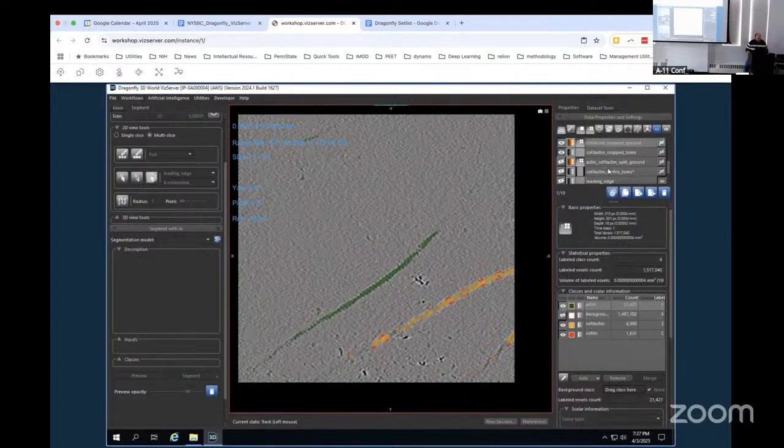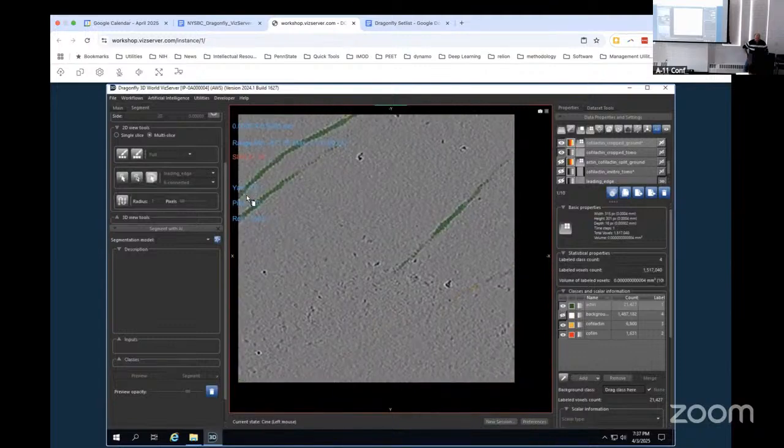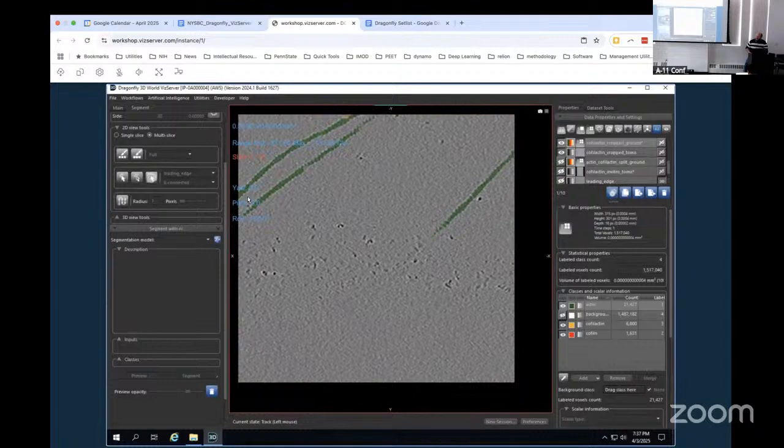It's called cofilactin cropped ground. This is the one that has already been cleaned up. So I've already gone through and passed everything to the back. So let's pretend that we did that. It's not real fun to do, so it's all right that you missed it.